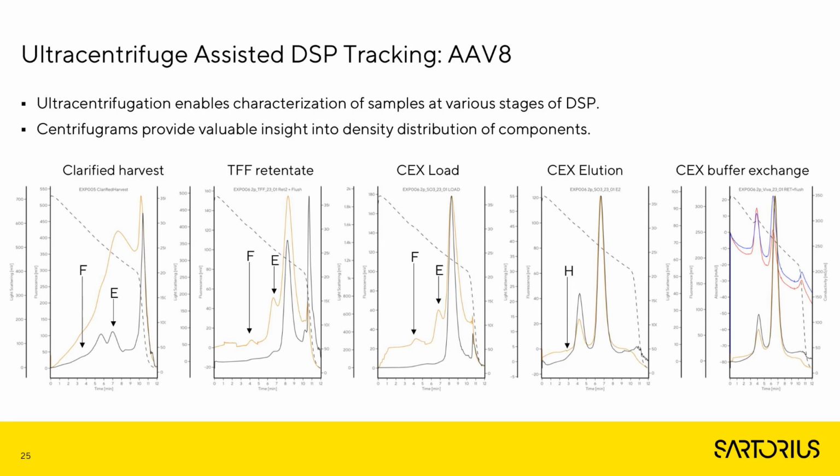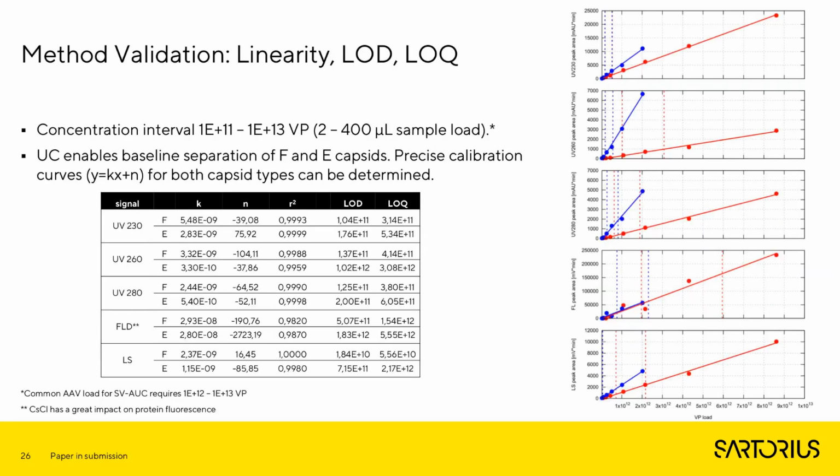So we were, of course, interested how accurately we can actually quantify our samples with this approach. So we performed a similar method validation as Andrea was explaining before for chromatography. Again, we prepared first different concentrations of AAV and estimated the linearity of the method, as well as limit of detection and limit of quantification.